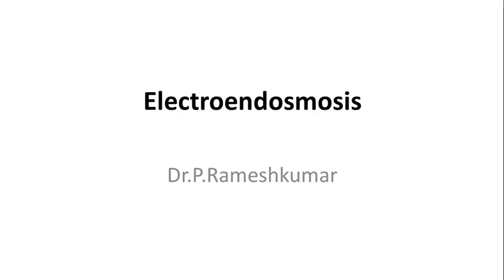Today's topic is electroendosmosis. This is one of the major important factors affecting the rate of mobility, and it significantly affects the rate of migration of molecules, especially proteins and DNA, under electrophoresis. So how does it affect them? What phenomena are happening? How does it work? We are going to see a lot of details.